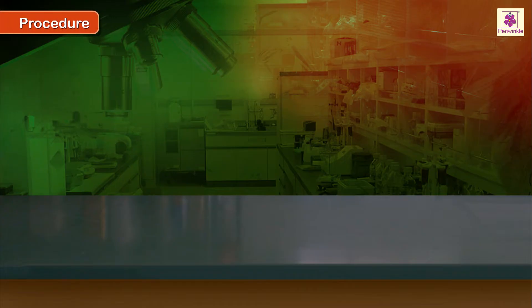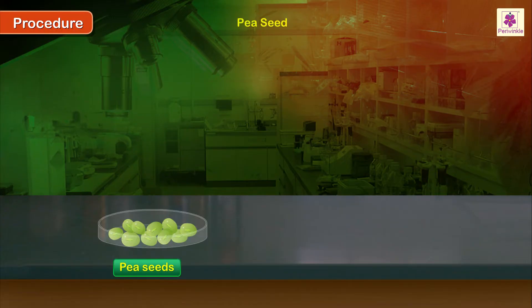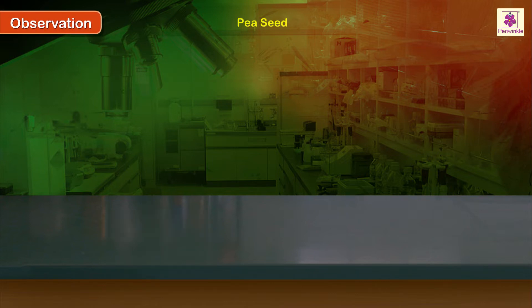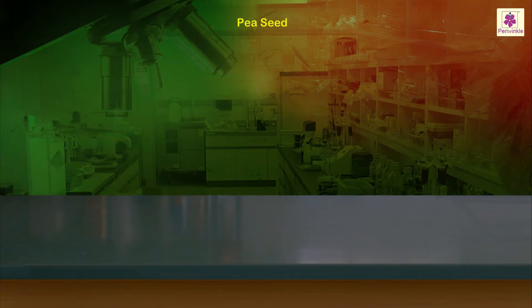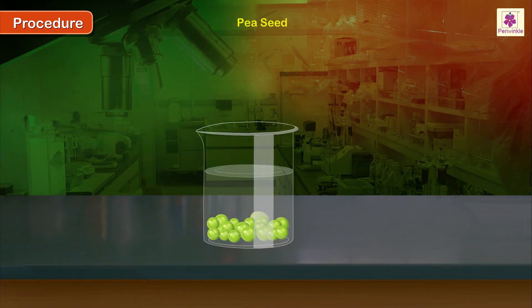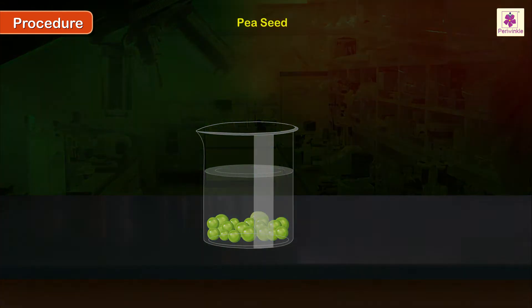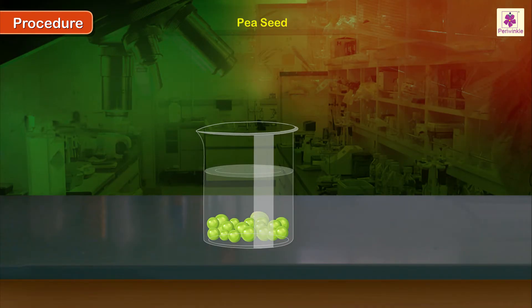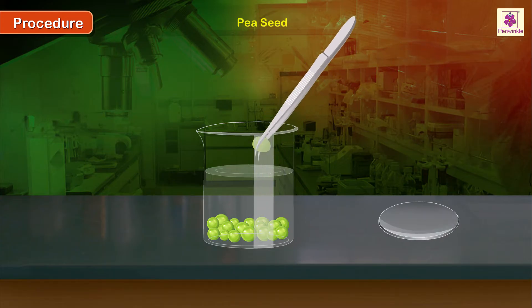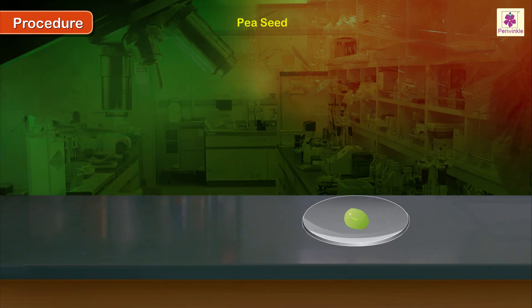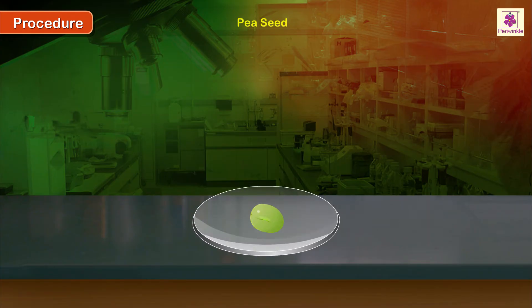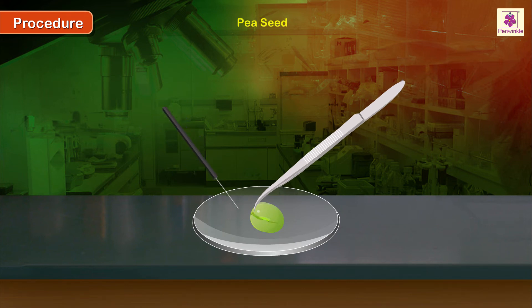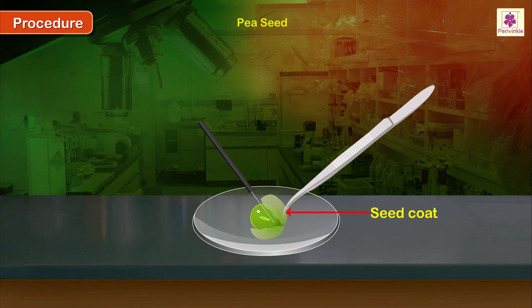Procedure: Observe a single pea seed from outside. Observation: the seed is green and brown. Take the pea seeds in a beaker and soak them overnight in water. Using forceps, carefully pick up one seed from the beaker and place it in a watch glass. With the help of forceps and a needle, remove the seed coat from the seed.